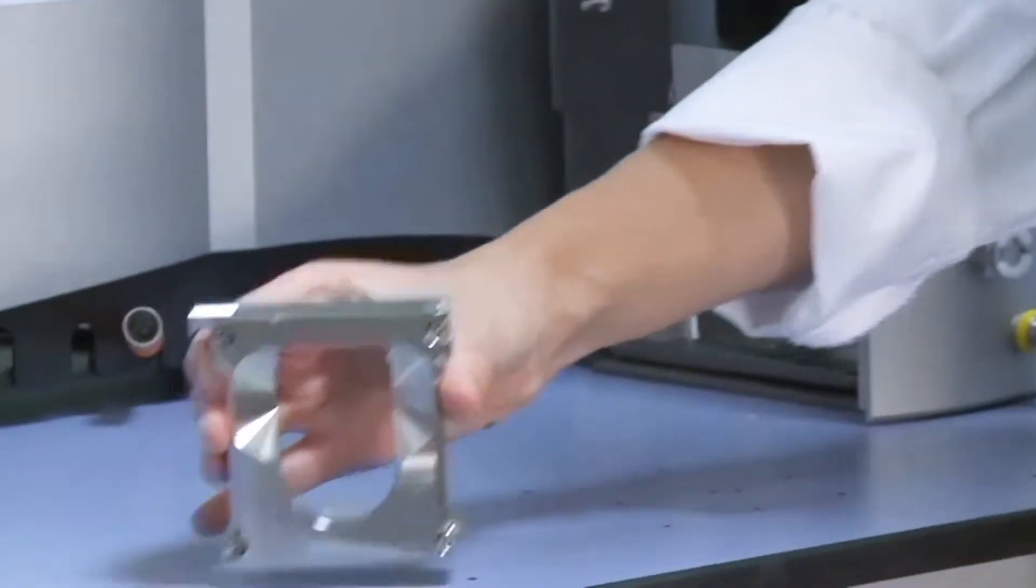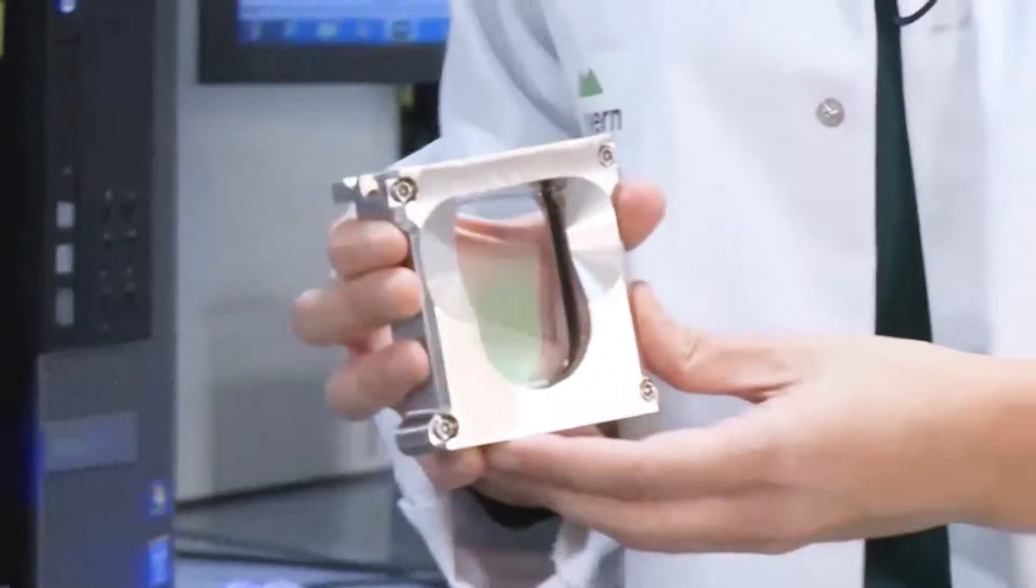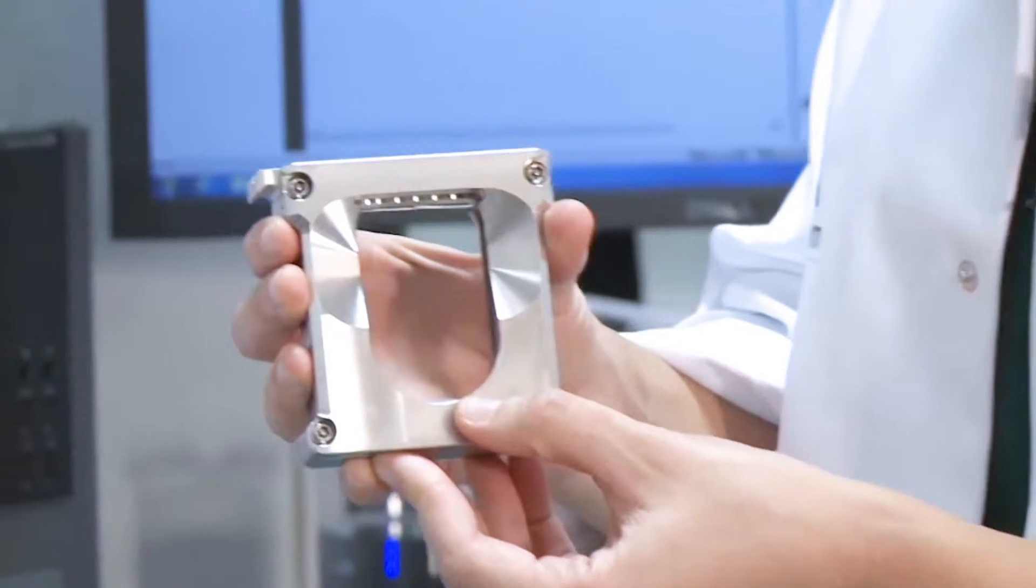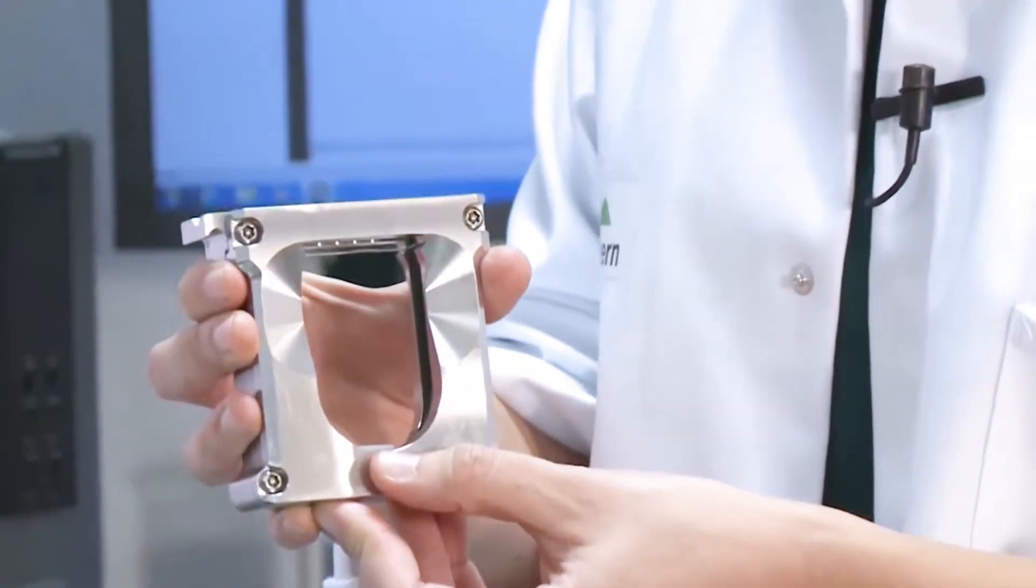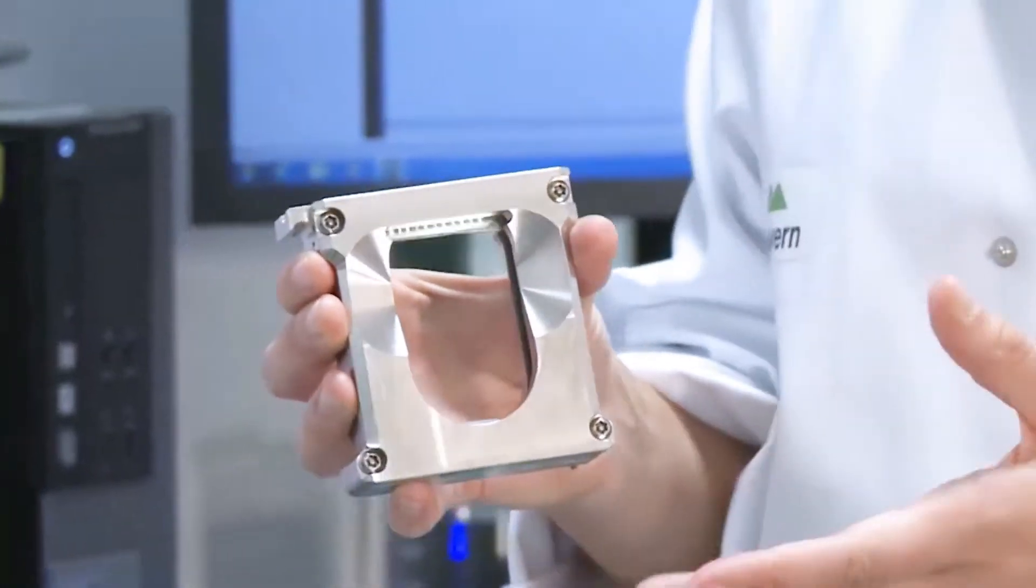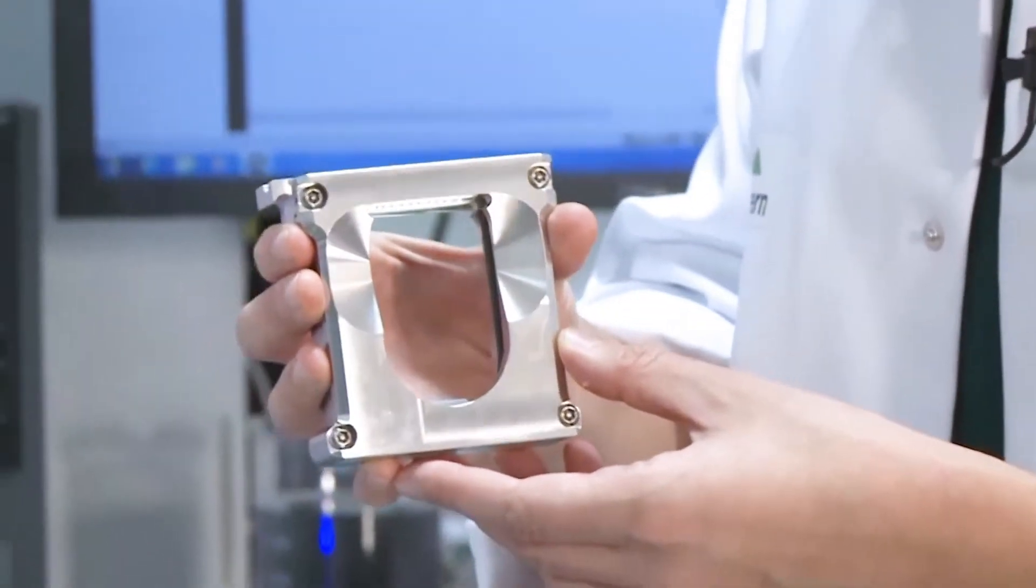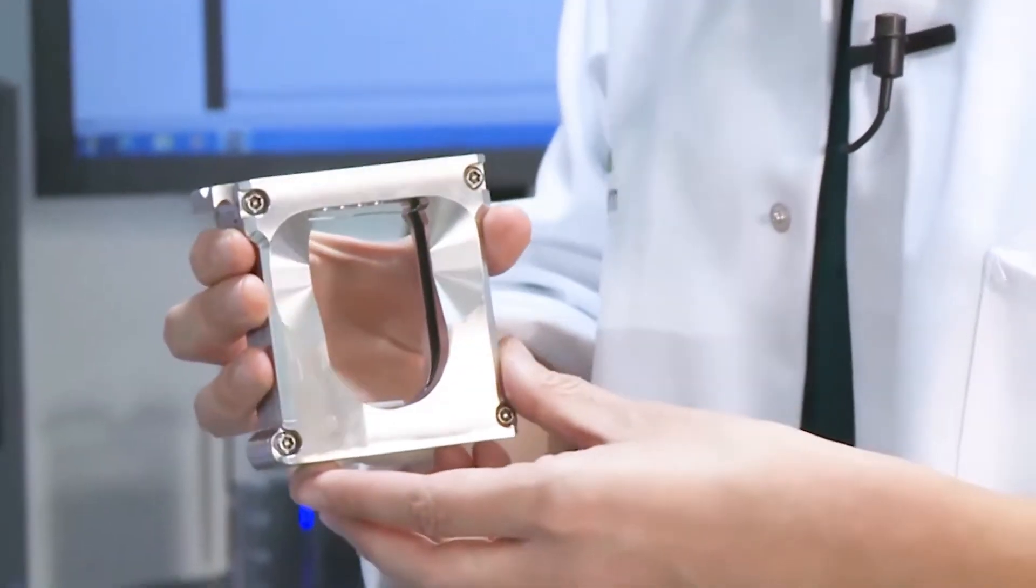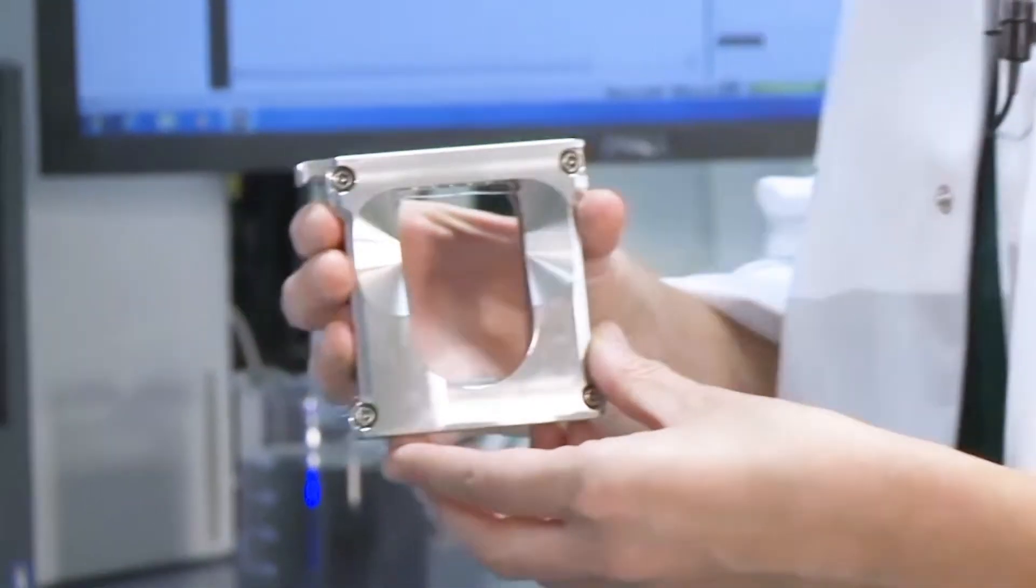Thank you very much, Debbie. OK, so this is the cuvette for the Hydro SV dispersion unit, and what it is is a simple cuvette. It has a magnetic stir bar. It's also got this asymmetric design that lets us suspend and representatively sample particles up to about 200 micron in size. So it's a very simple design, and we can measure in about six to seven milliliters of dispersant.